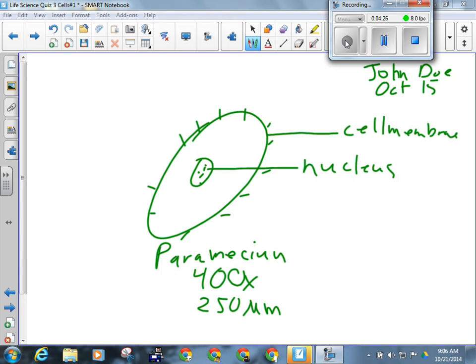Even some of you may be fortunate enough to see maybe a Golgi apparatus, maybe rough ER around the nucleus. We don't usually see mitochondria, but sometimes people get lucky. Chloroplasts, we should see those in the plant cell. If you look hard enough, they're kind of fuzzy green dots. We should be able to see all of those types of things and label them, and that's going to be important because part of your justification in your analysis is that you saw these structures that help the cell carry out basic functions. Everyone with me on that one? So just be mindful of that. We want to be as thorough as possible when reviewing everything today.